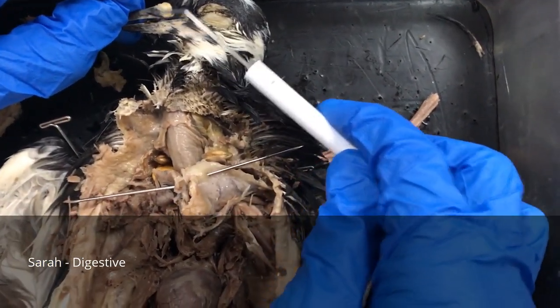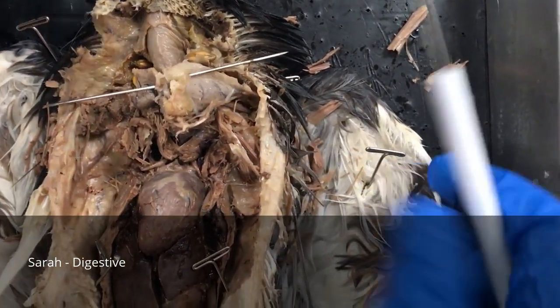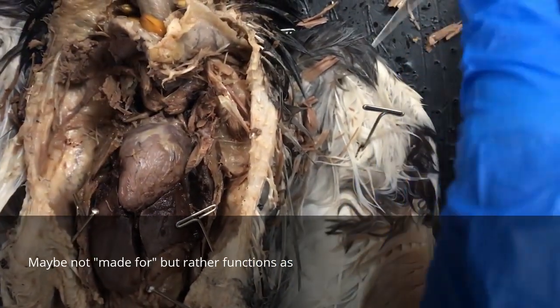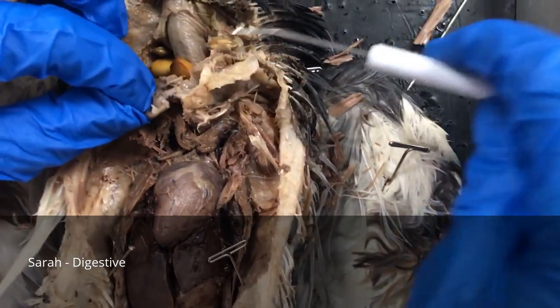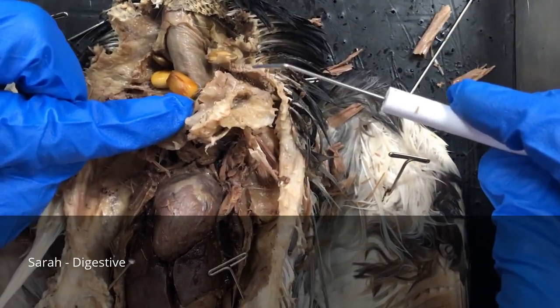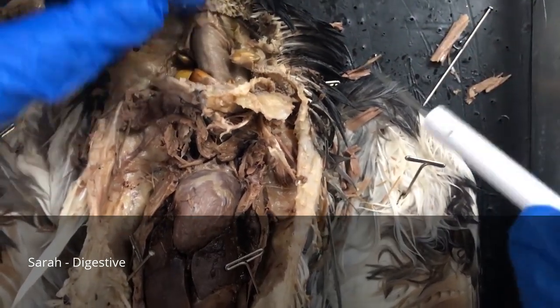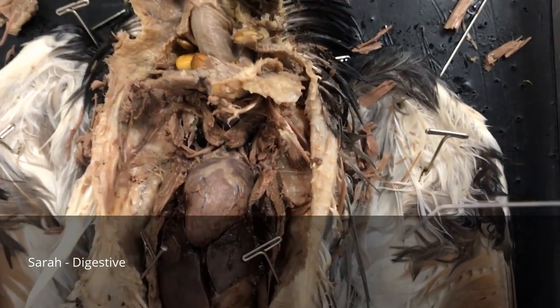So they eat through the mouth, and then the food goes all the way down through the esophagus into this. This is called the crop. Now, if you notice, the crop is made for storage. And see, there's its corn, the feed it was digesting before it was killed before our dissection, which was pretty interesting. And then after it goes through the crop, it goes down to the proventriculus, which is also known as the stomach.